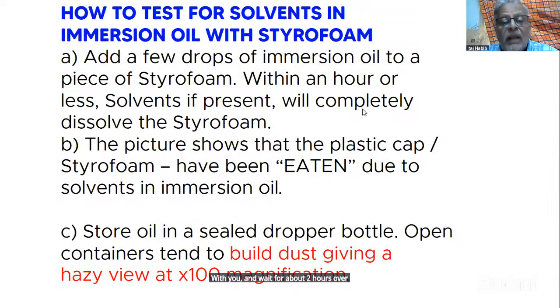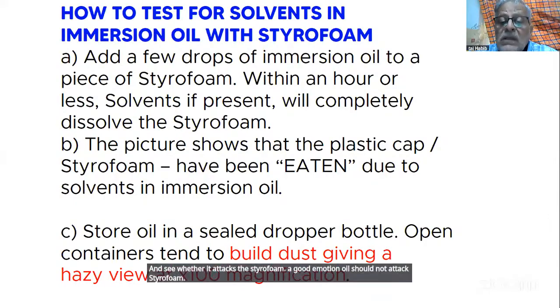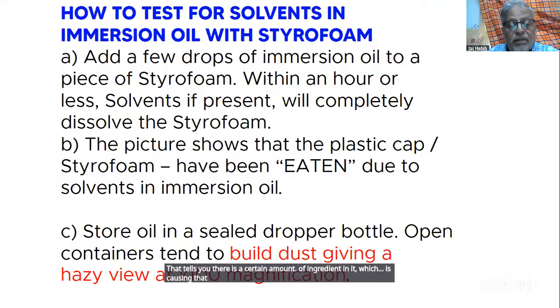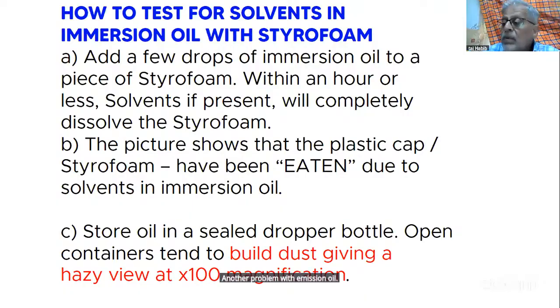Overnight probably, and see whether it attacks the styrofoam. A good immersion oil should not attack styrofoam. That tells you there is a certain amount of ingredient in it which is causing that problem. Another problem with immersion oil is most laboratories keep it open. So the dust builds in the oil, and that creates a very hazy view when you are using times 100.